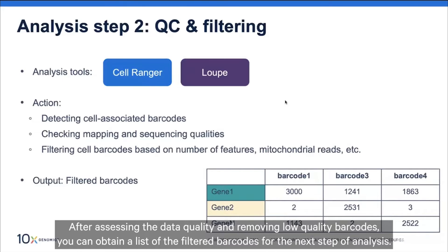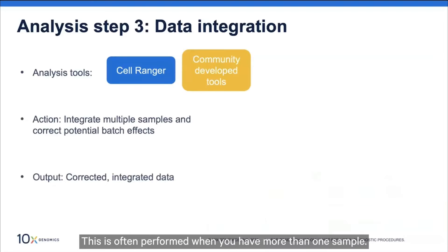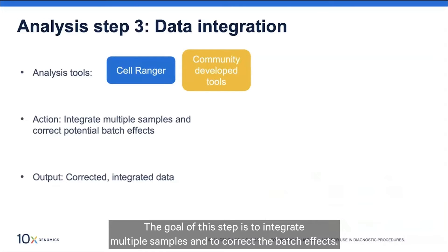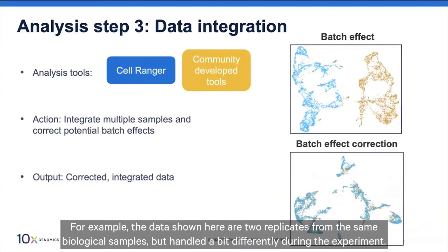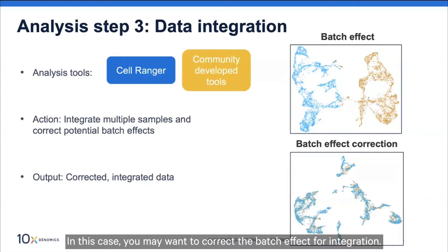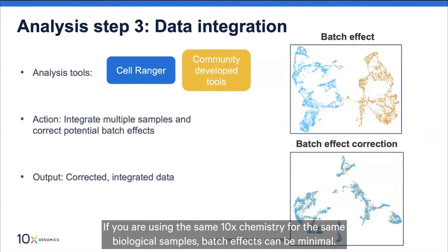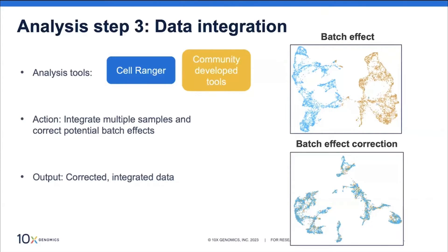The third step is data integration, often performed when you have more than one sample. You can achieve this using Cell Ranger or community developer tools. The goal is to integrate multiple samples and correct batch effects. For example, two replicates from the same biological sample but handled differently may appear as separated groups when visualized, suggesting batch effects. Batch effects can result from various technical factors, such as samples handled at different times or by different people.